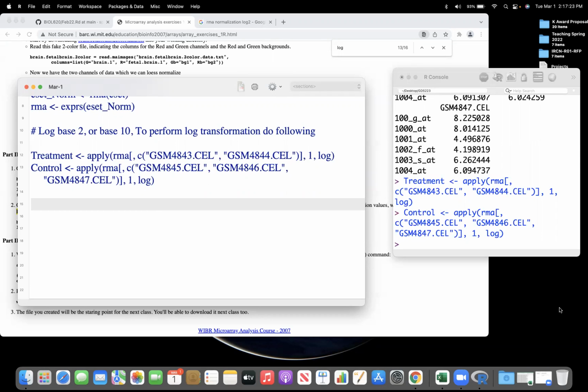One, two. Wait. Remove that. Remove this, before the first name.